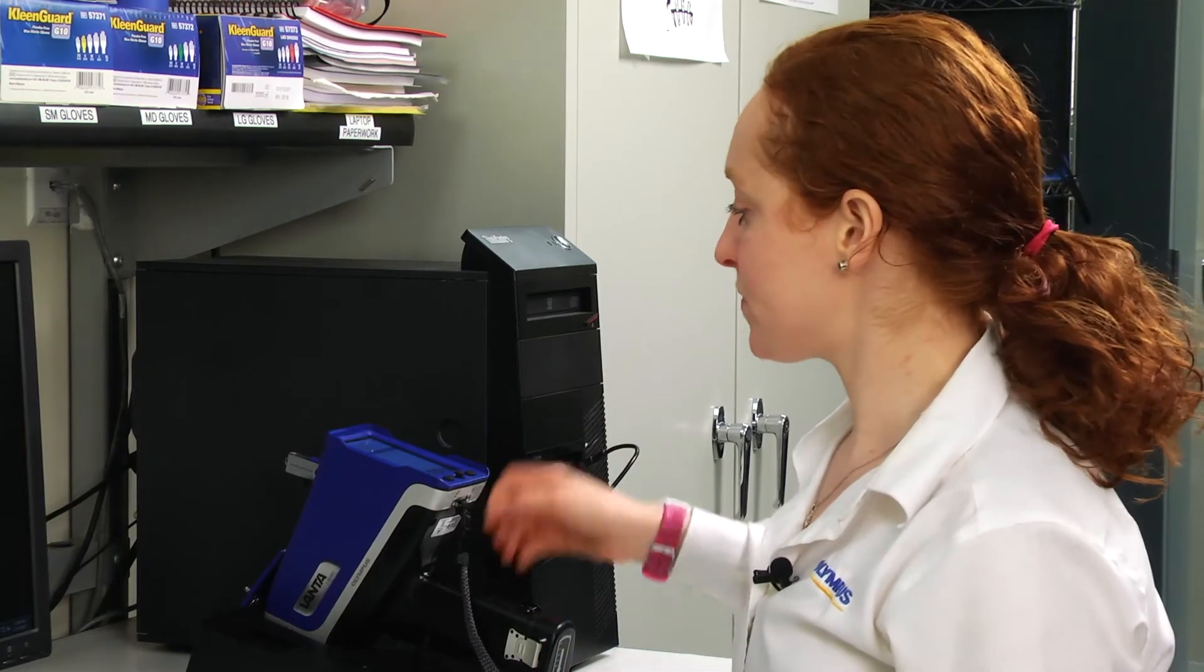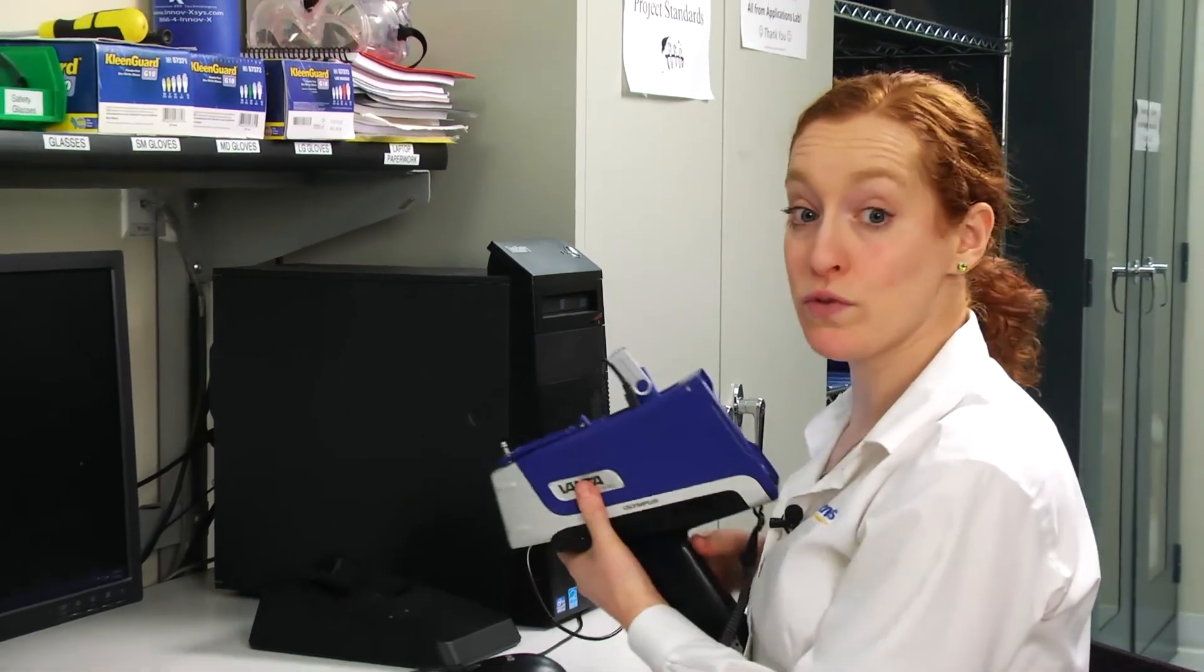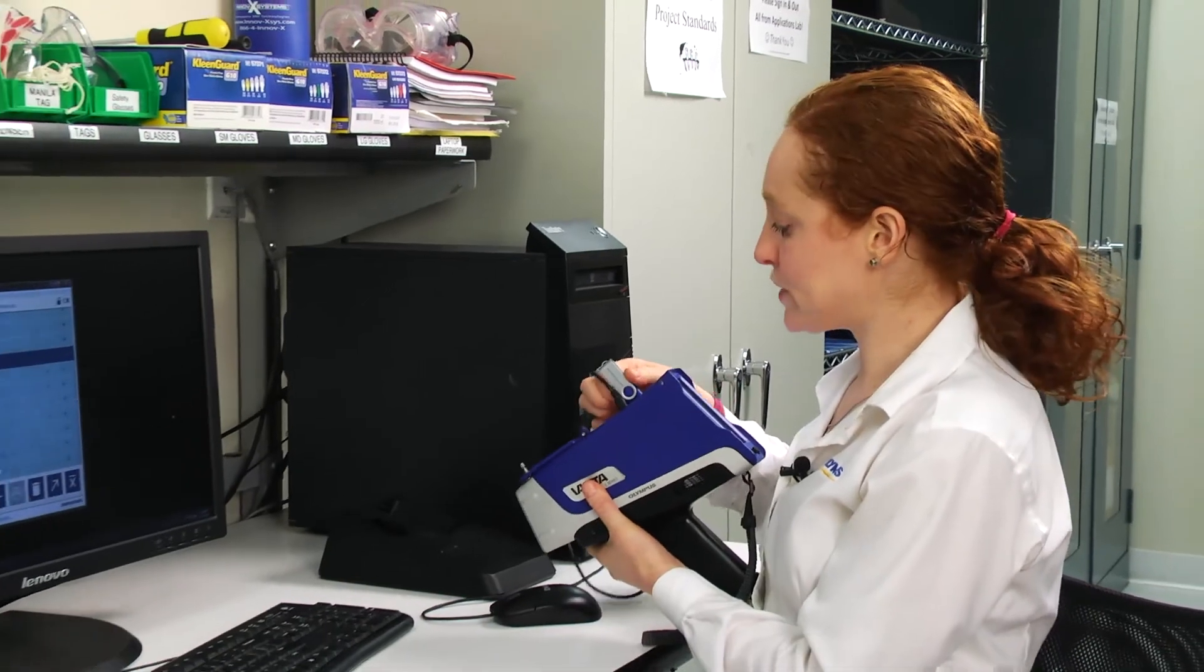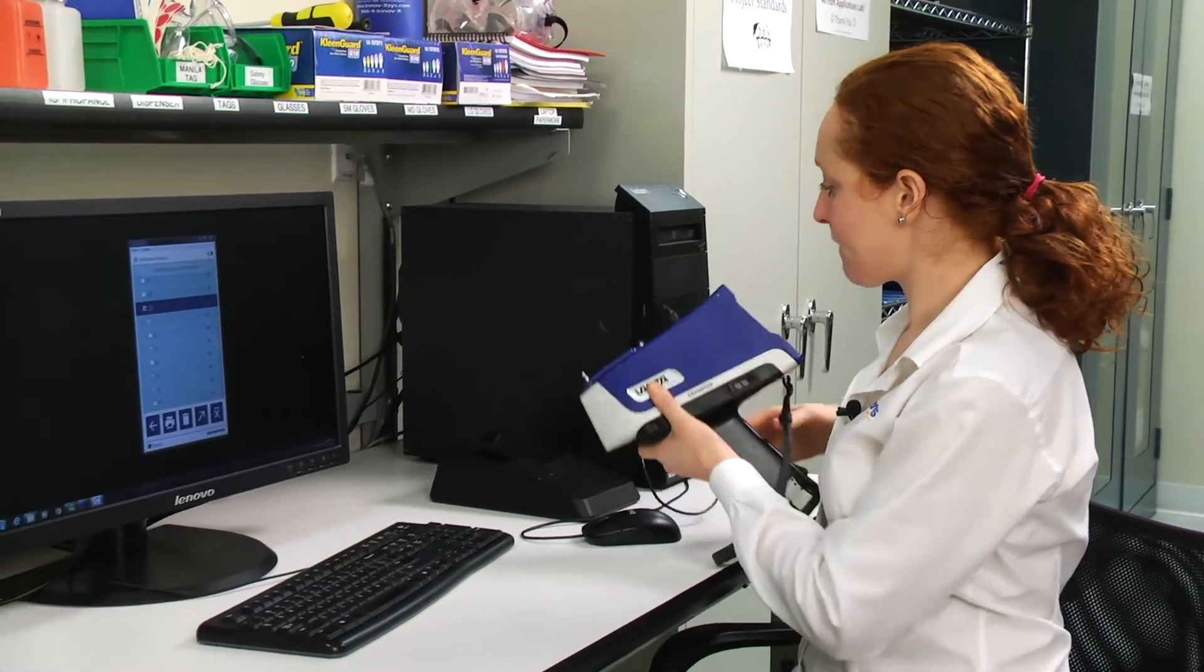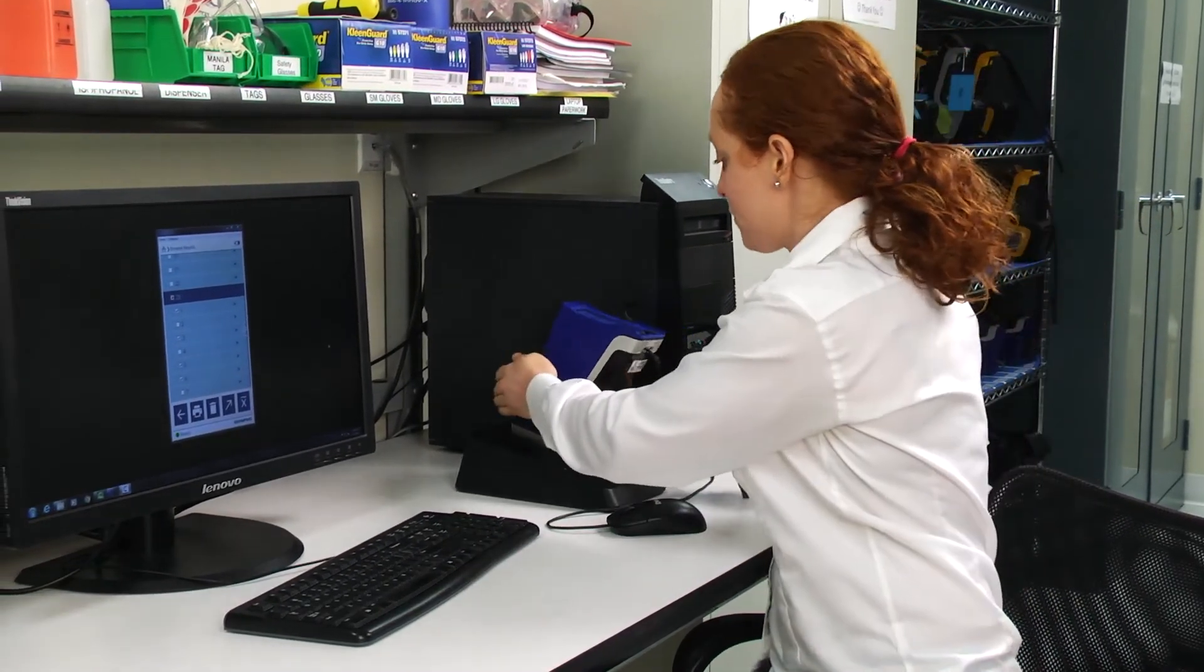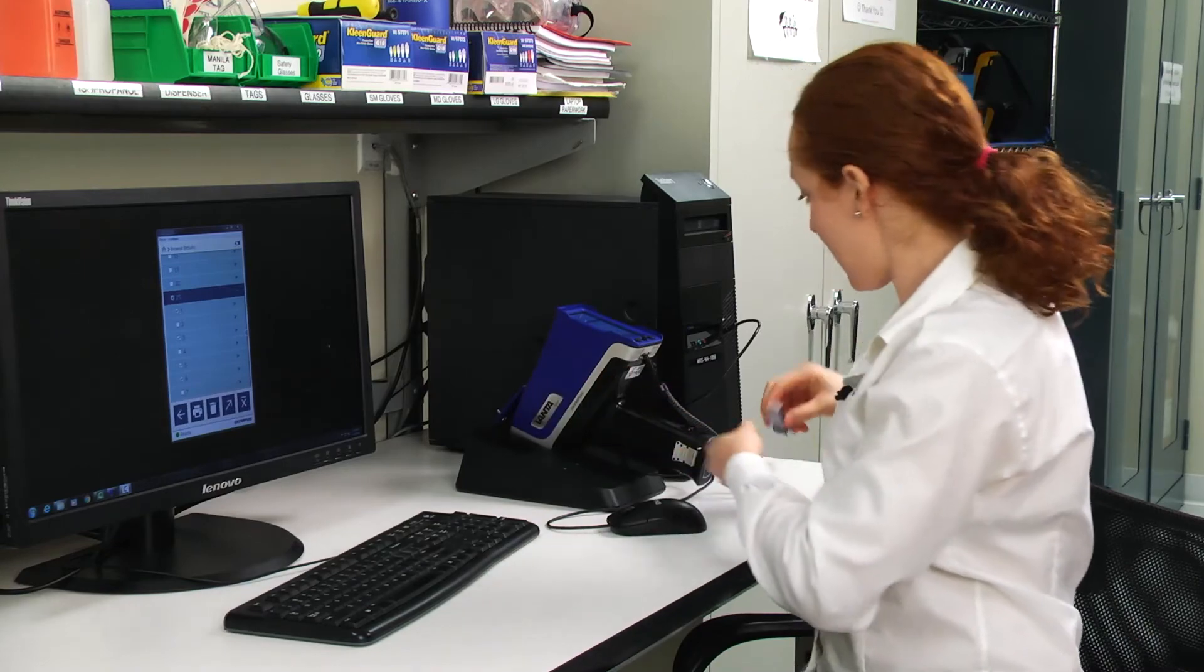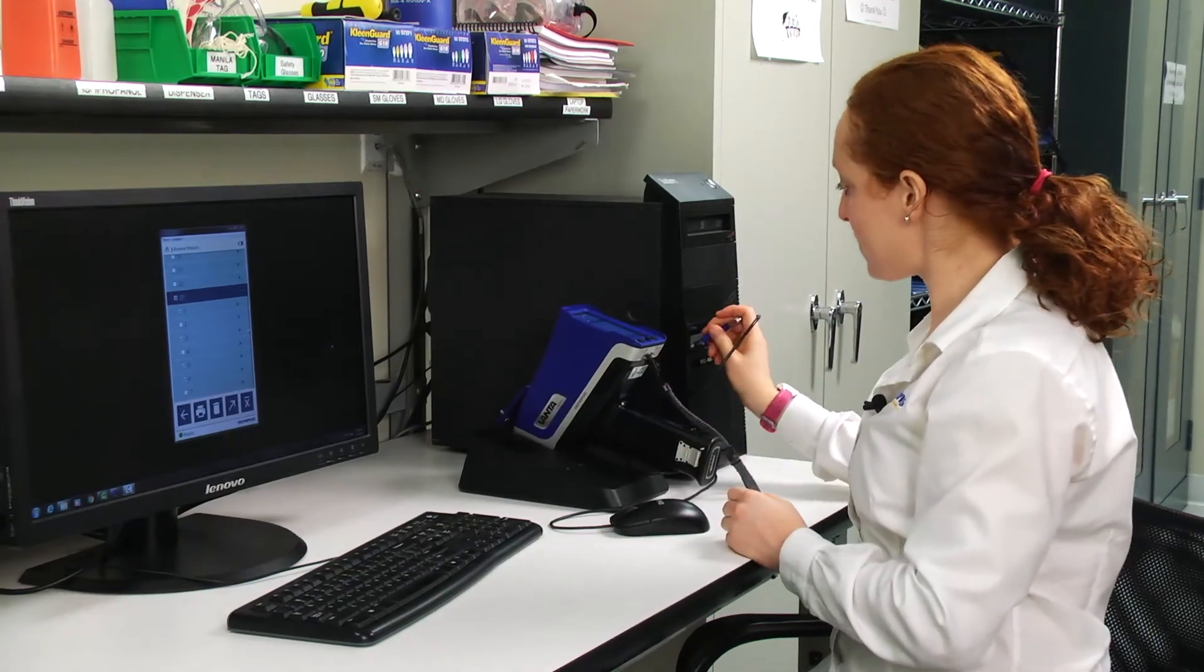To retrieve my results, I'll remove the USB device from the Vanta and insert the USB into my PC.